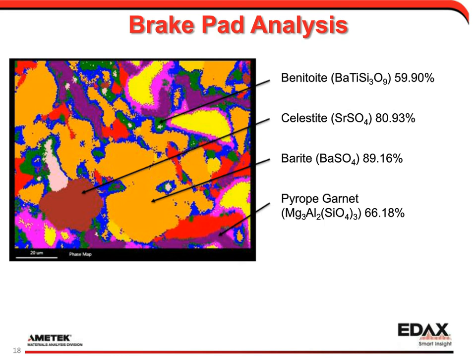As I said, we're just using some mineral standards here, which might not be the best library to apply to a brake pad that's been used. But if you have the right library for your application, you'll have quite good indication of what's the compound. So the brief answer in this case, I know that it's bound to the silicon because that's my standard, but I don't know that it's bound to silicon in this exact sample.